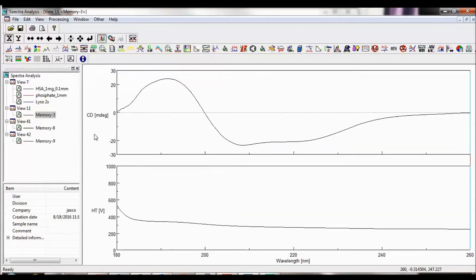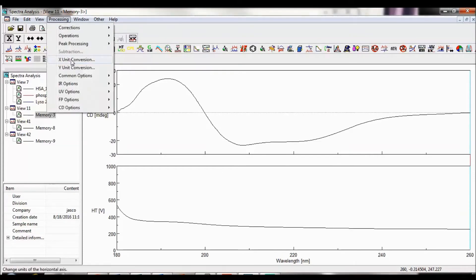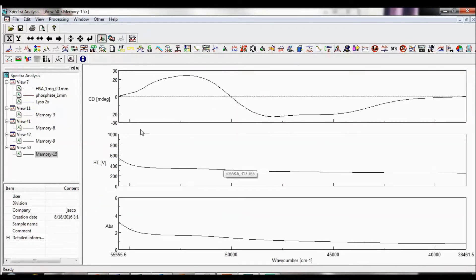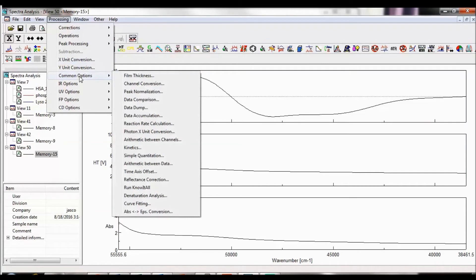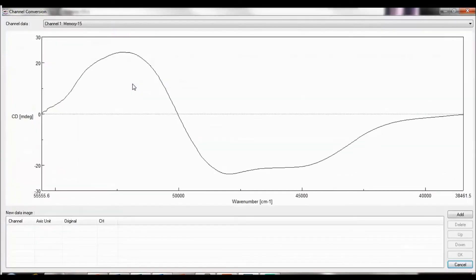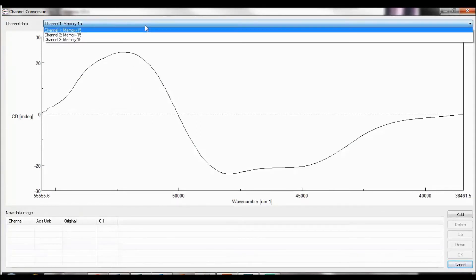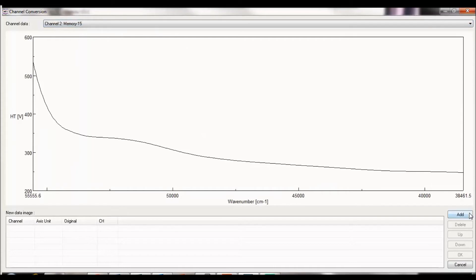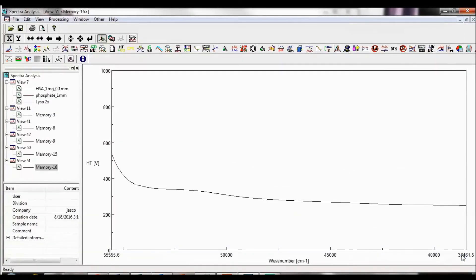To convert the X-axis units of the spectrum, select Processing, X-Unit Conversion. Unlike horizontal axis units under the View menu which only changes the X-axis units of the view, X-Unit Conversion creates a new memory with new X-axis units. The Common Options drop-down list provides more data processing functions such as channel conversion. Since data processing is only performed on channel 1 or the top graph, the channel conversion operation allows you to select data from another channel in the active view to process. By adding that channel to the list below, a new memory of that specific channel is created and processing can now be performed on that new memory.